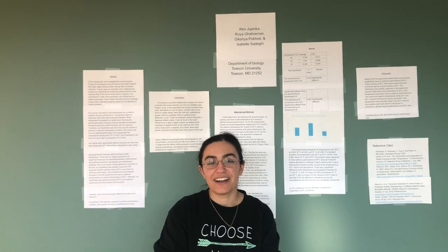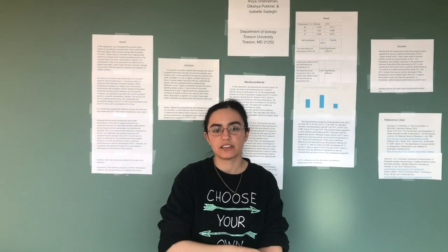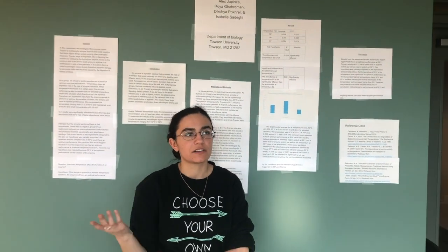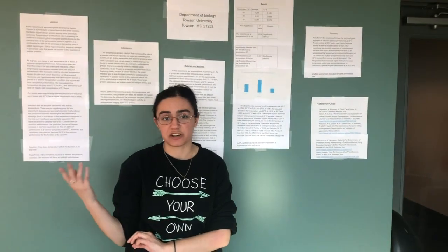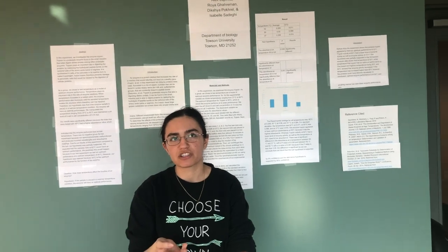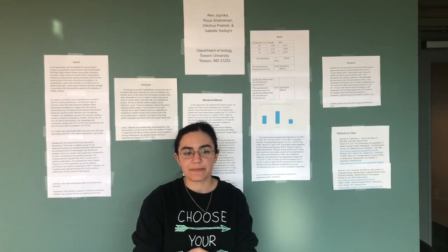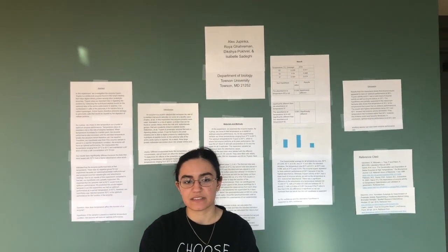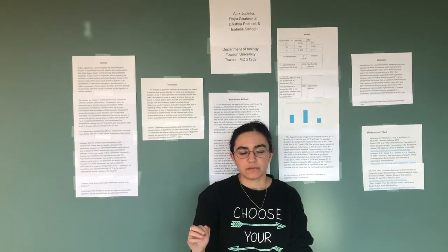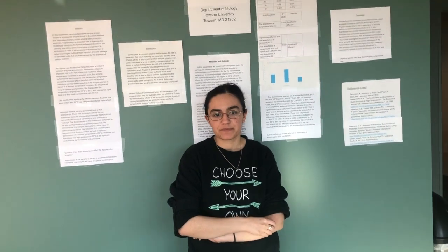Our experimental design was adequate to test our hypothesis. However, our execution was not good. We had errors mainly with our water temperature in the bath and our spectrophotometer. Our hypothesis was partially supported in the experiment because it shows that 50 degrees Celsius is the temperature at which trypsin had an optimum performance.